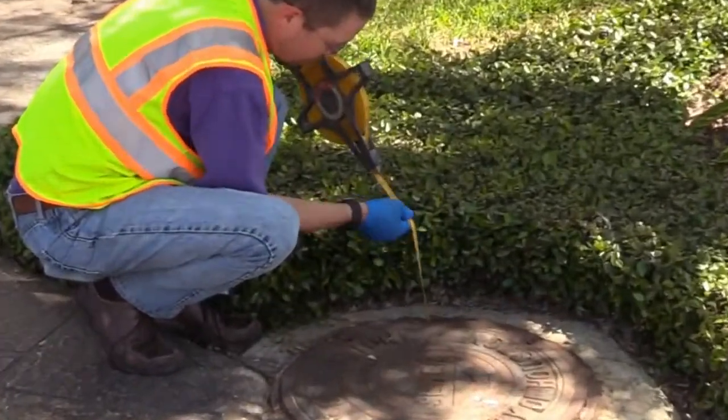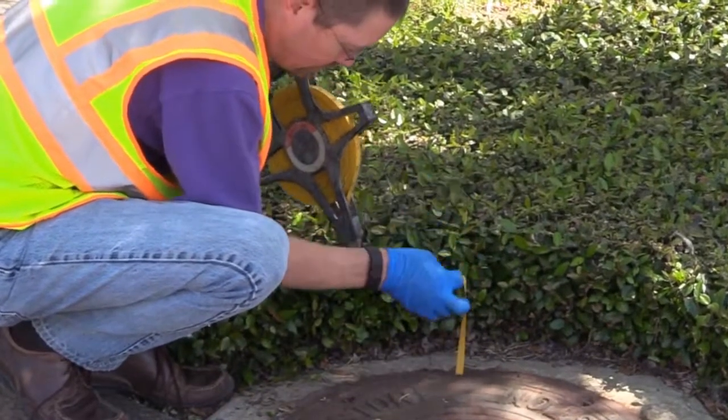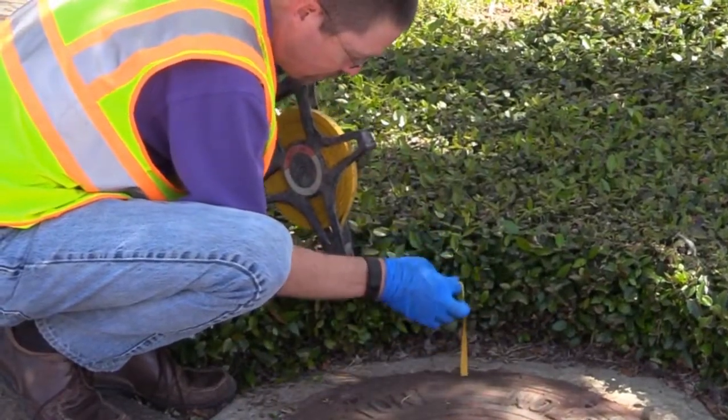If the manhole cover does not have vent holes, slide the cover off to create a small opening. In order to minimize the mixing of ambient air, the manhole cover should not be completely removed until after sample collection has been completed.